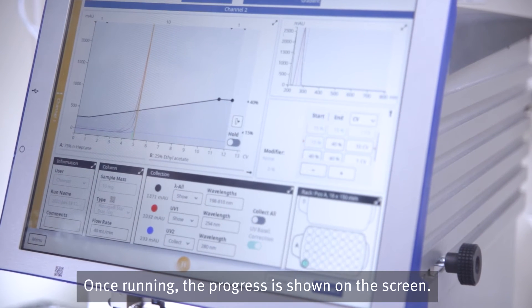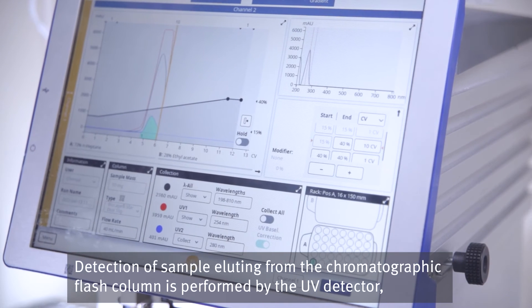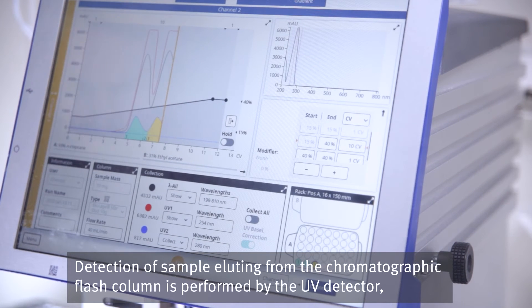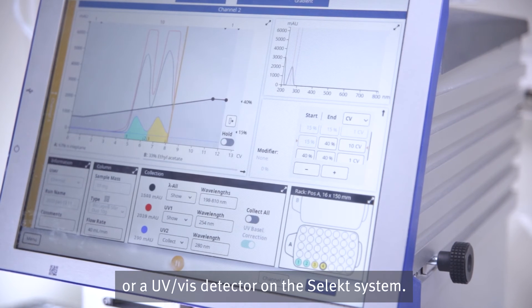Once running, the progress is shown on the screen. Detection of sample eluting from the chromatographic flash column is performed by the UV detector, or a UV-Vis detector on the Select system.